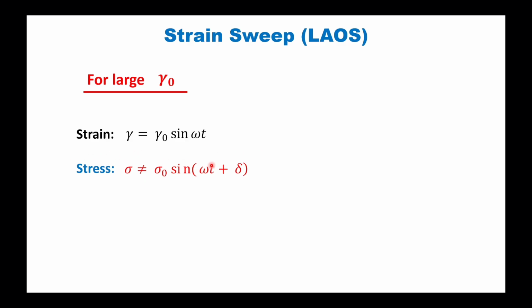This is because in the LAOS case, we have different harmonics, or different frequencies that are usually multiples of the fundamental frequency. So this relationship fails in this regime.